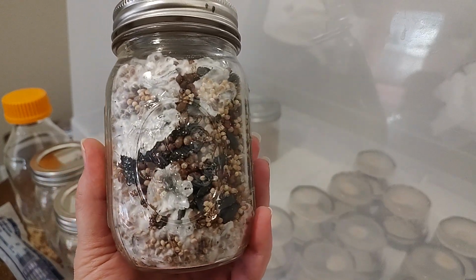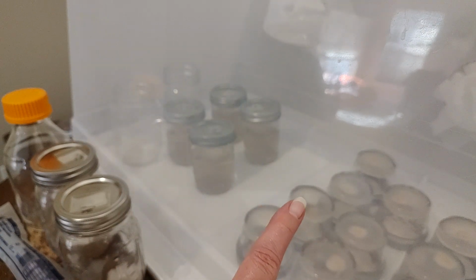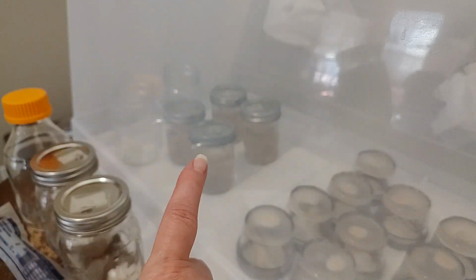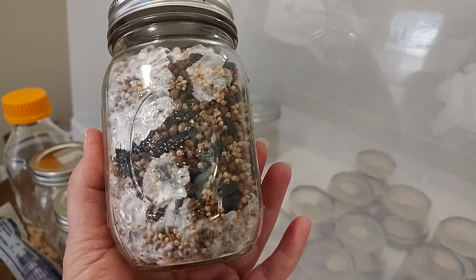Again, you can grow your spore on these no pour jar or petri dishes. You can put spores straight to the agar and grow them out, and you can put the agar straight into your bird seed, or you can make the liquid culture, the slurries. So again, there's choices.